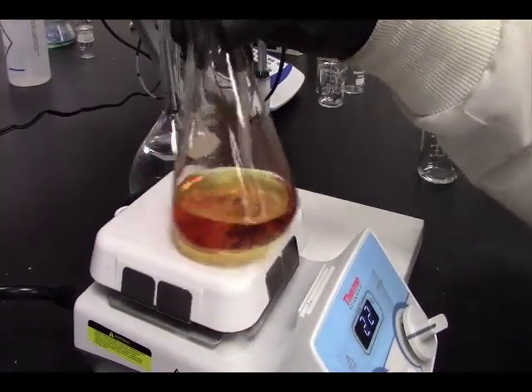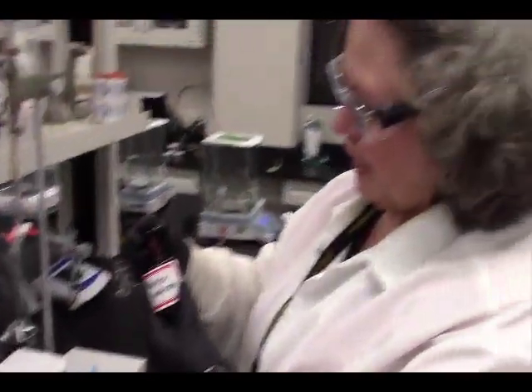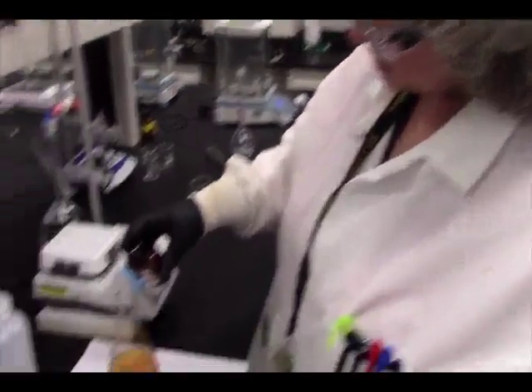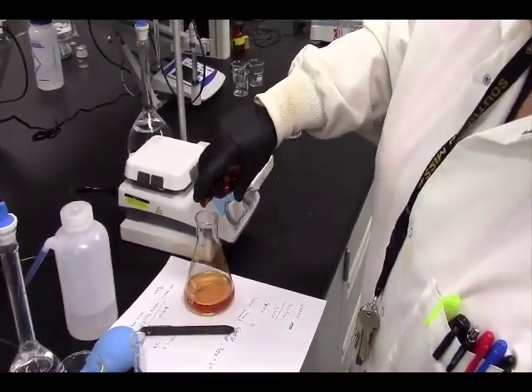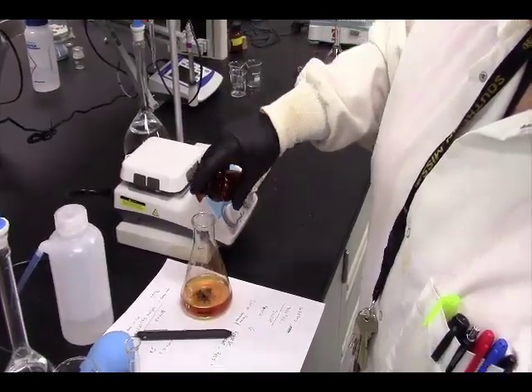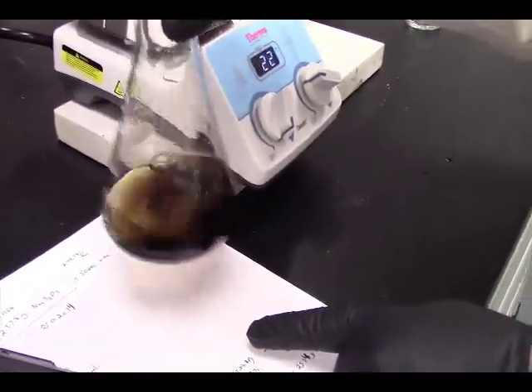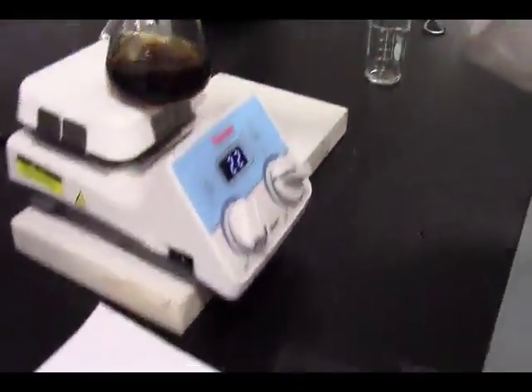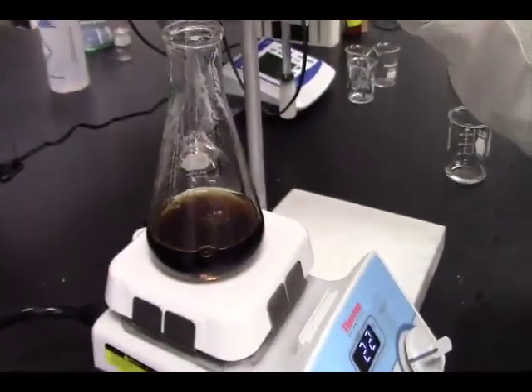Yeah. All right. Let's add our indicator. Starch. Starch with I2 makes a complex, or well, with I3- really. Did you see that when it dripped in? That's what it should look like to give you a dark color. Now we're going to titrate this to clear.